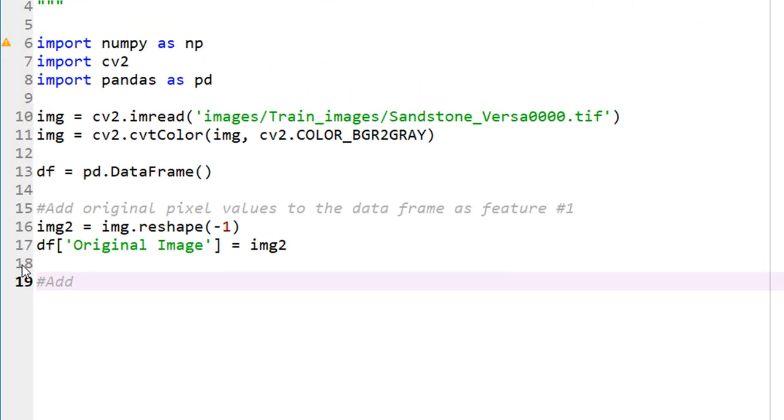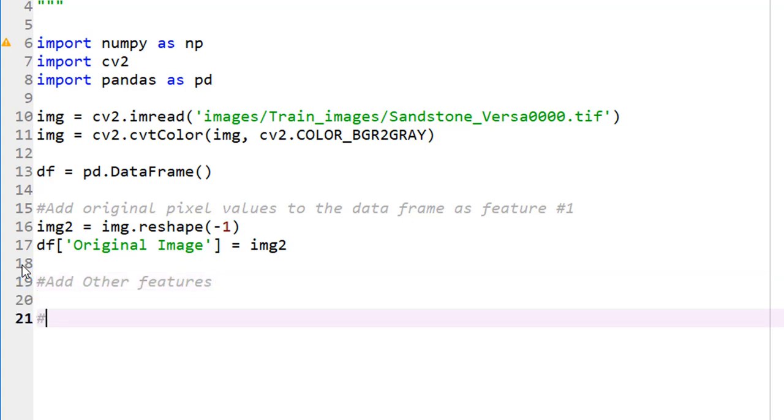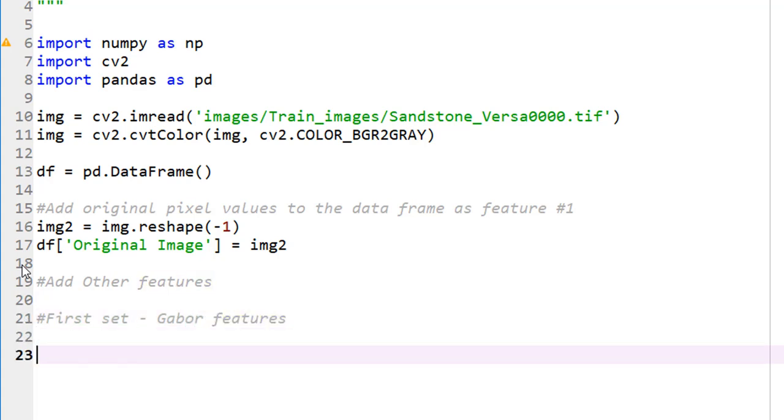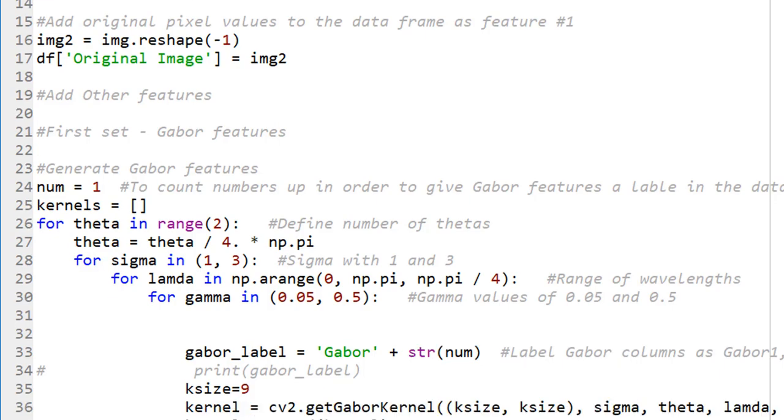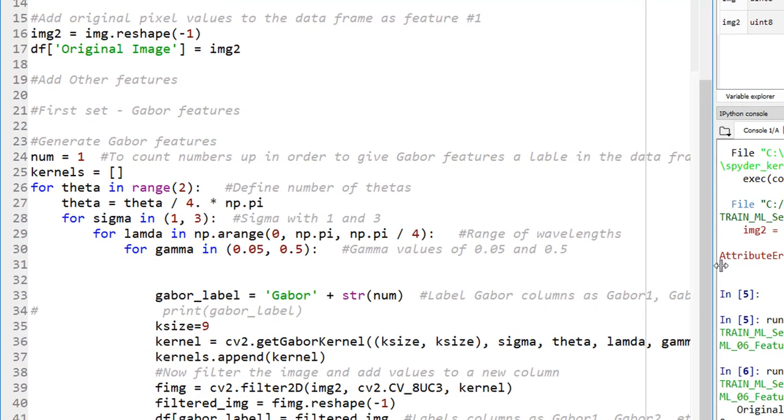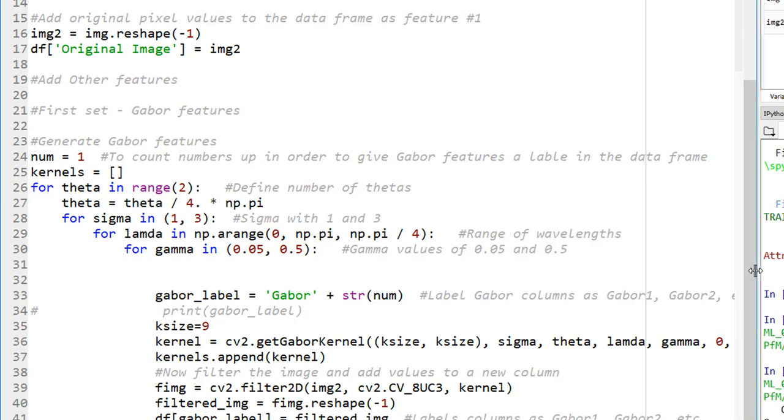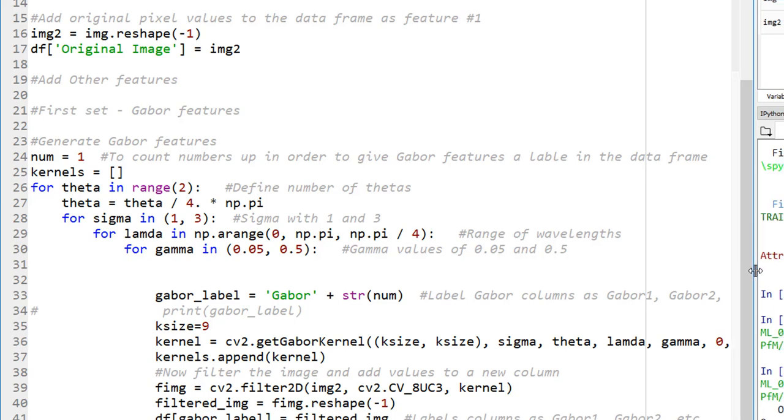If you look at the variable explorer on the top right, my img2 is 1024 multiplied by 996 entries. My data frame has one column named 'Original_Image'. Let's print df.head which prints the top five rows. The top five rows are all zeros, which is fine. This is a sanity check. Now let's add other features. First set would be Gabor. This is my most favorite feature.